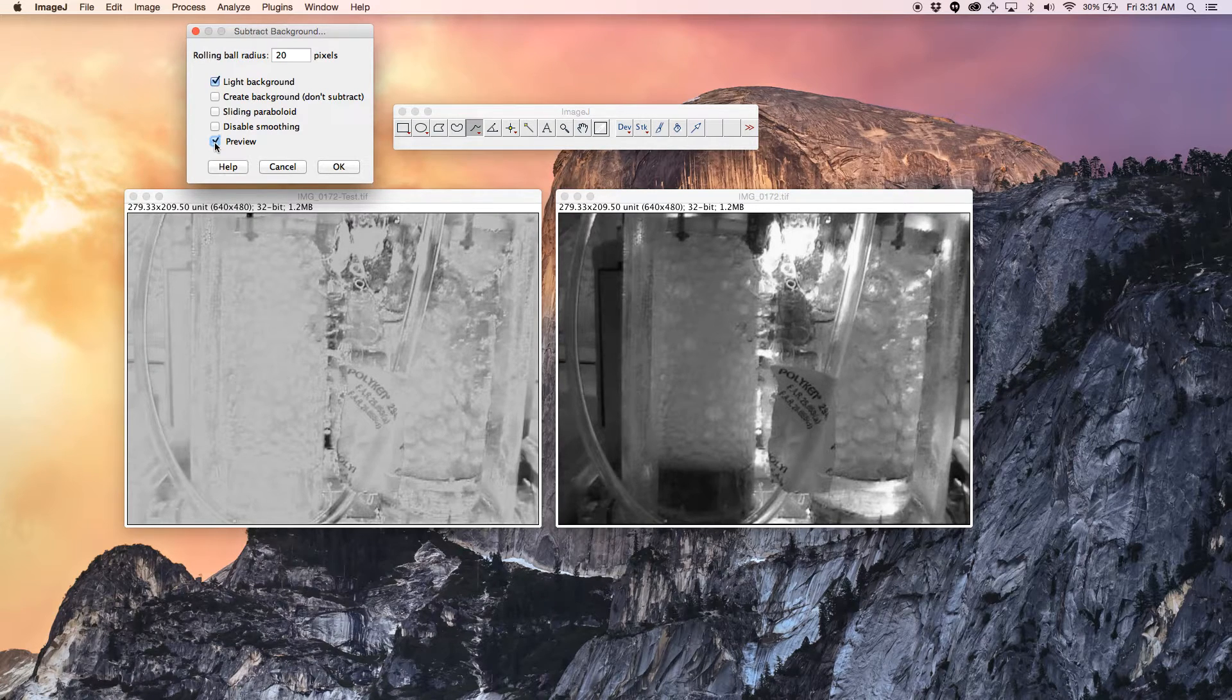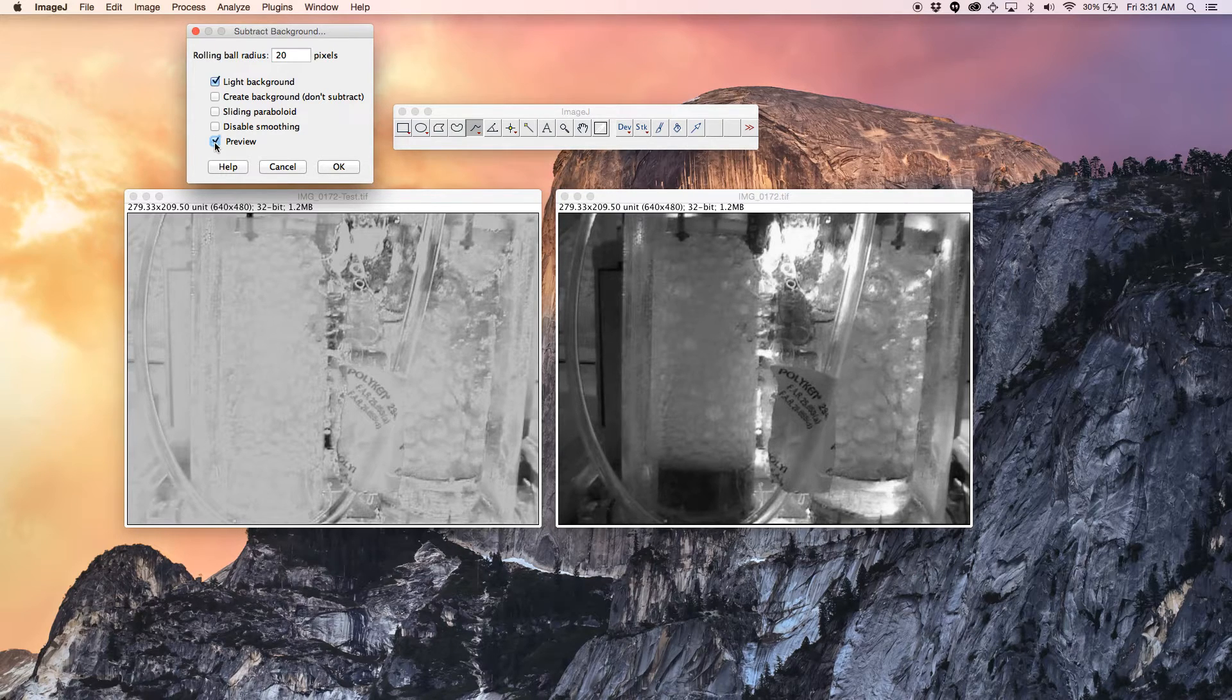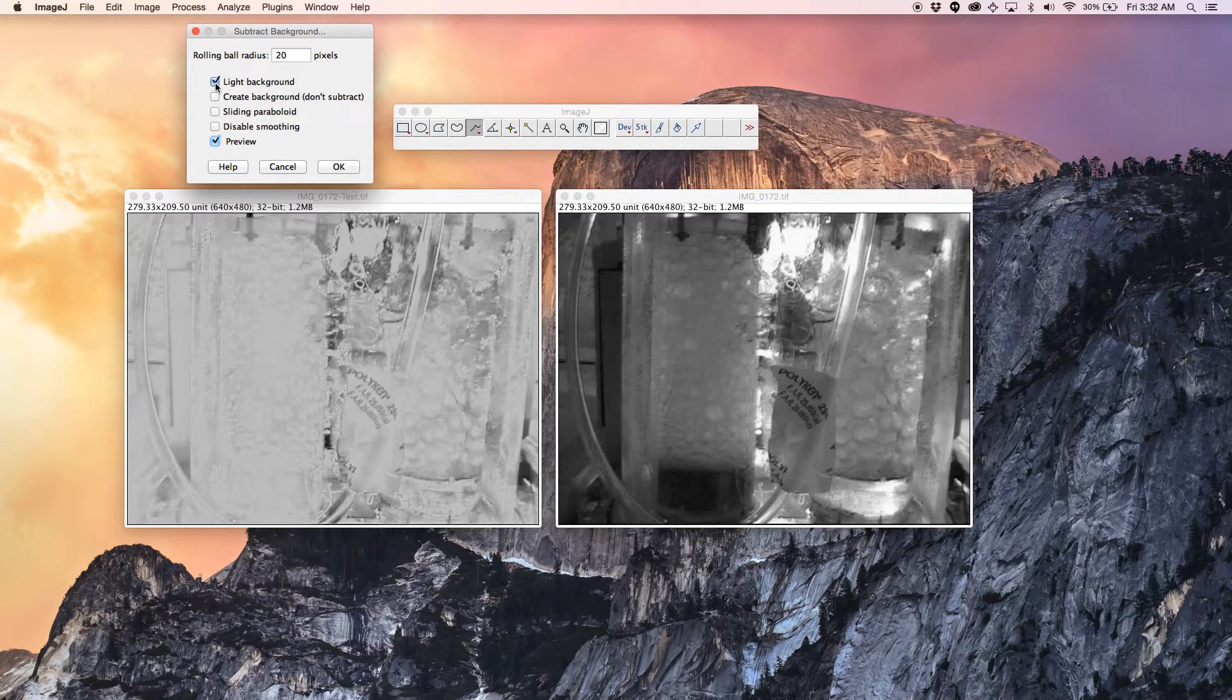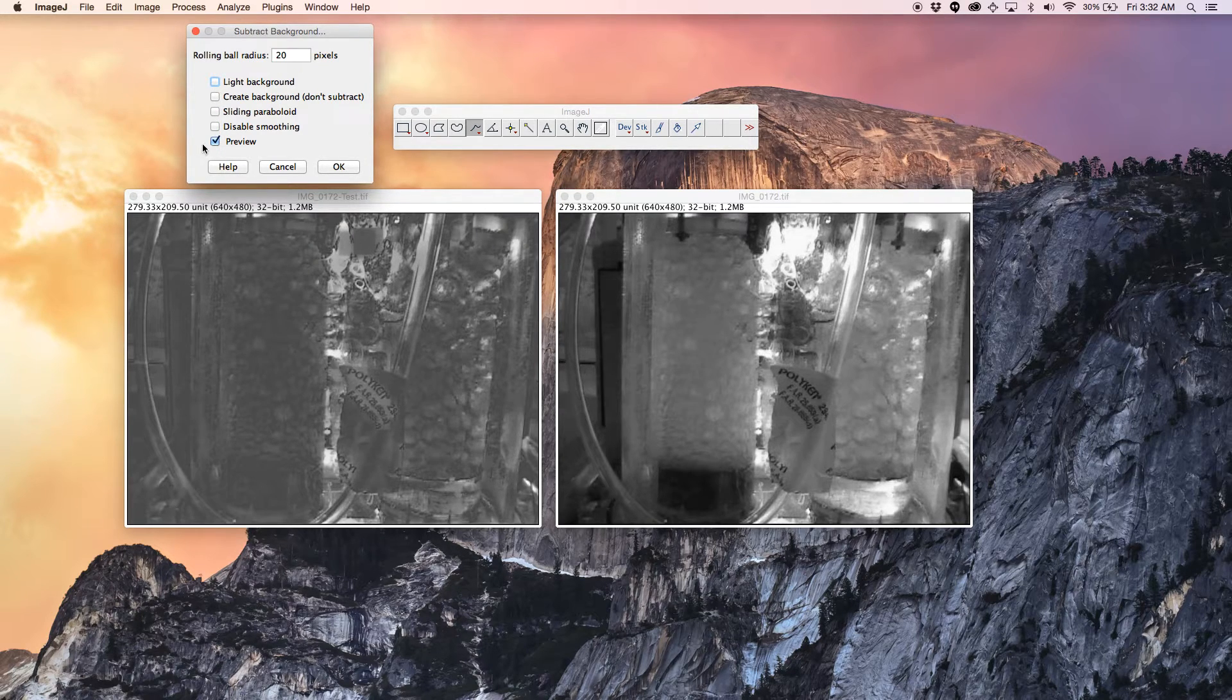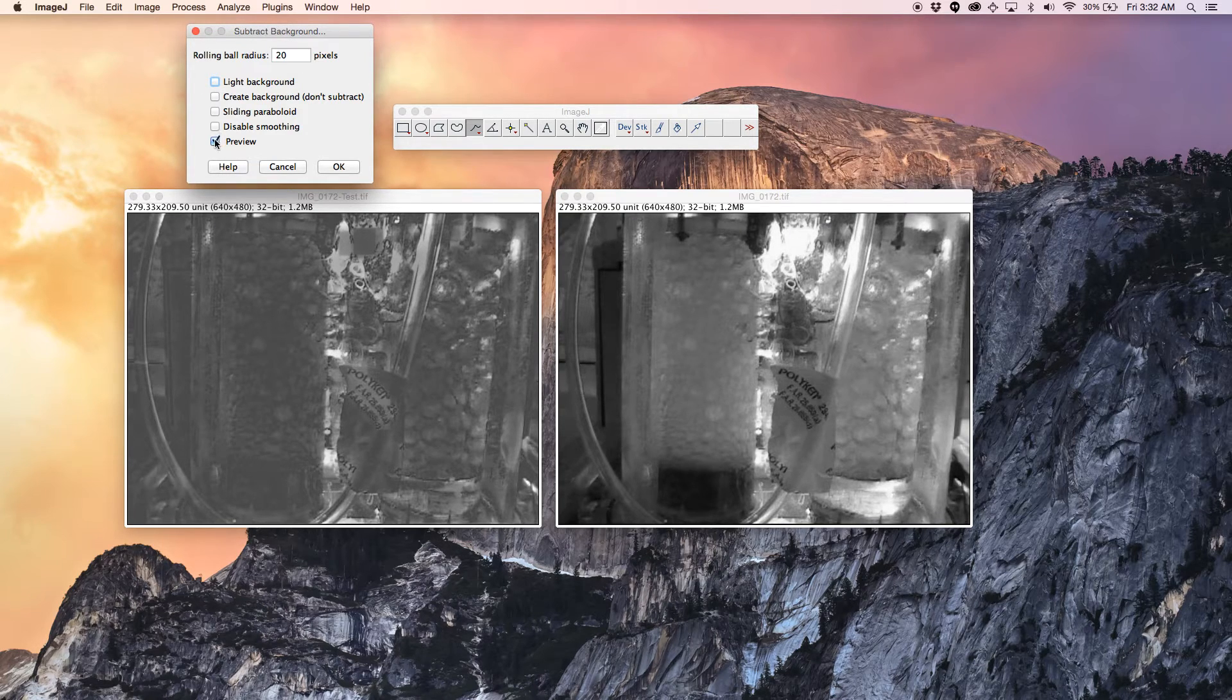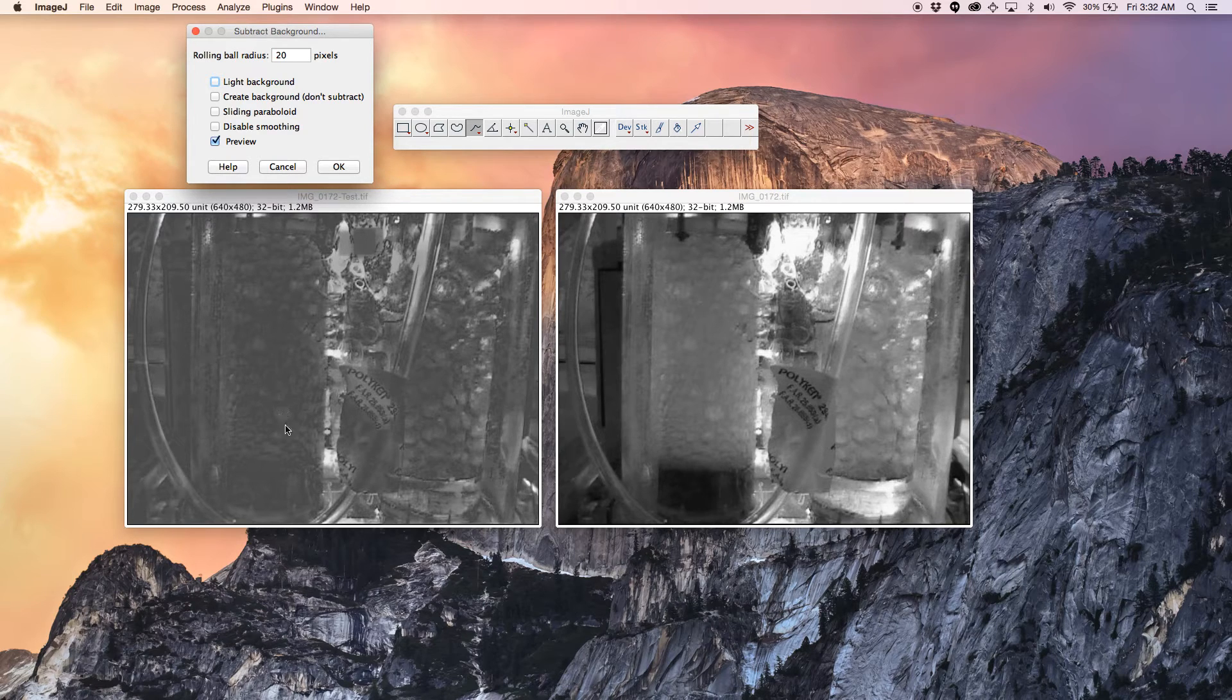For further information, you should read the ImageJ documentation. So I'm going to remove that. After you play around with this subtract background, which is under the process, you will be able to figure out how clear the images are.